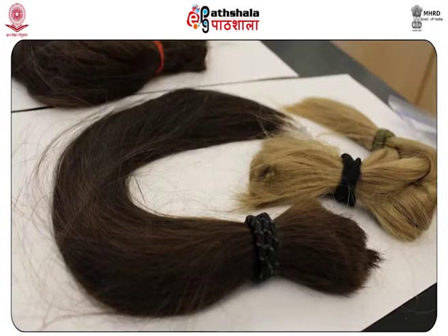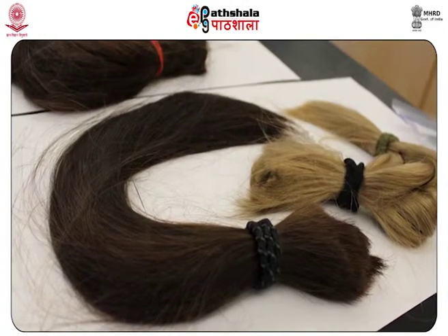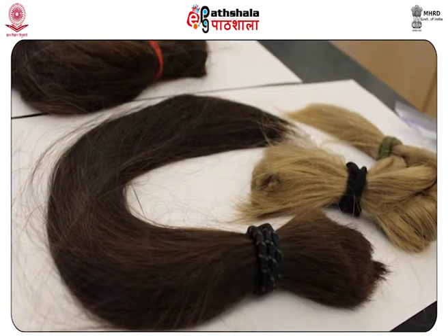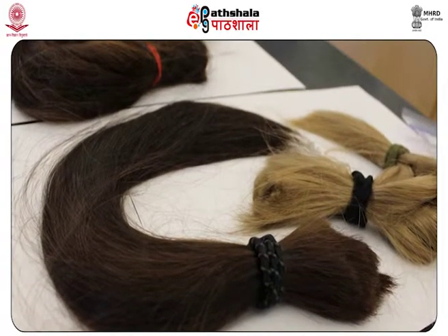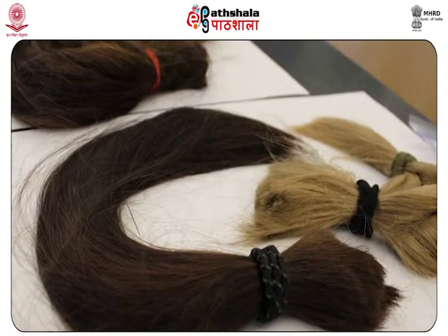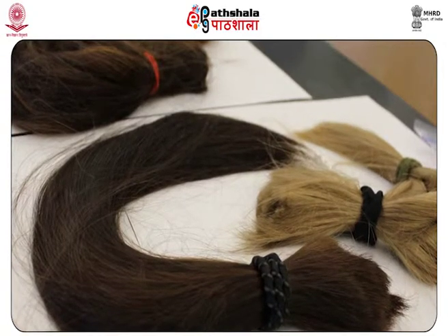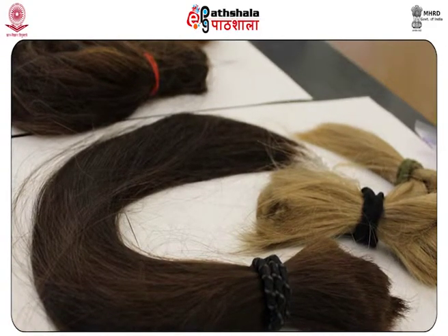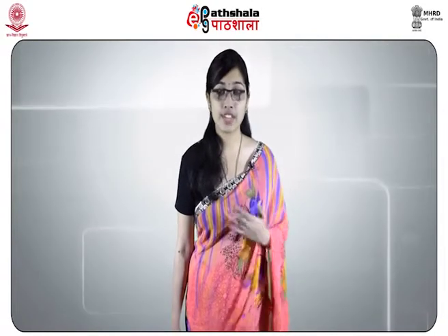Then we can see whether the hairs have been dyed or bleached. The natural color of the hair is found near the root end. The dyed portion of the hair may be long or short depending upon the period between the dyeing or bleaching and the collection. The examination also indicates the part of the body from which the hairs have come.